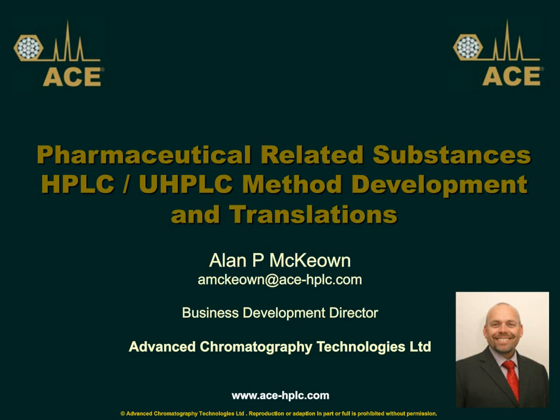Excellent. Does USP allow one to do method translation to other particle sizes for gradient separation, or is a complete validation work needed? Okay, so my understanding is that the allowable gradient changes are very, very small. I do not think that you can do what the question is asking. I think the restrictions are quite tight.